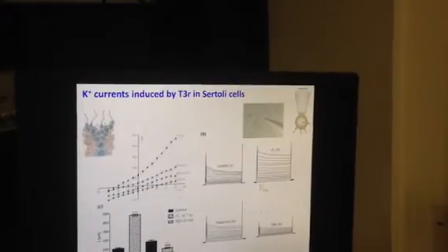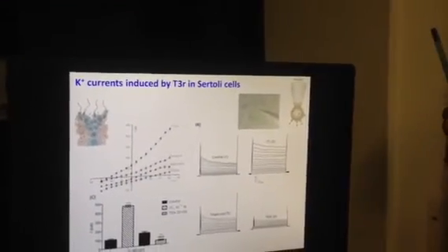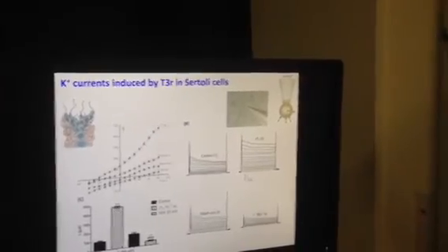And it was very interesting because the student who is actually doing this project showed that reverse T3 activates the calcium influx, the 45 calcium influx, which is a radiolabeled calcium that you can use to measure the quantity inside of the cell.